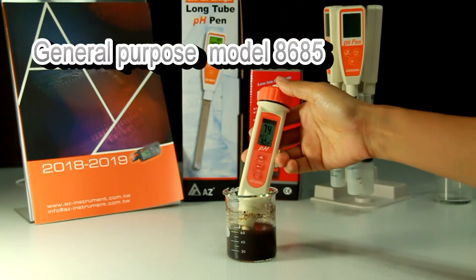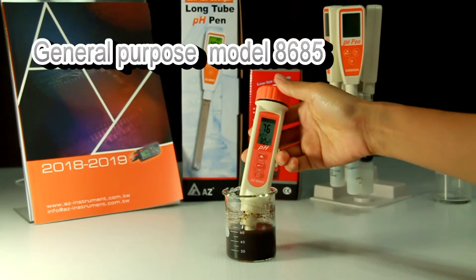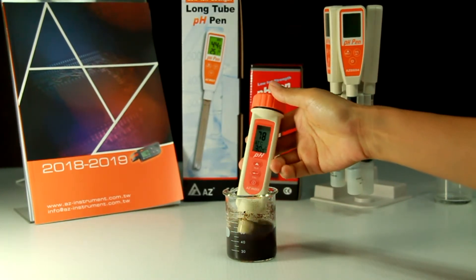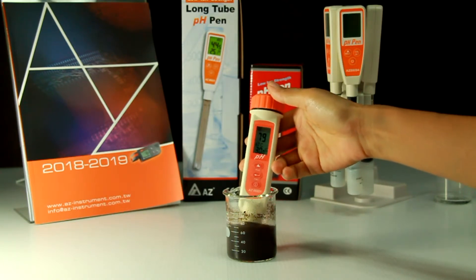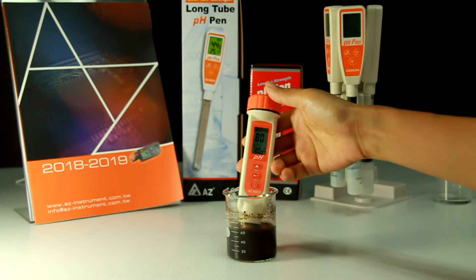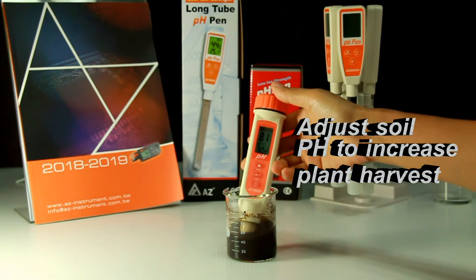If you need to measure the PH value of soil, you can use model 8685 as well. Mix the dry soil and distilled water in a 1 to 1 ratio and mix evenly. Immerse the PH probe and stir to get a stable reading. According to the measurement, you can adjust the PH value of soil to increase plant harvest.